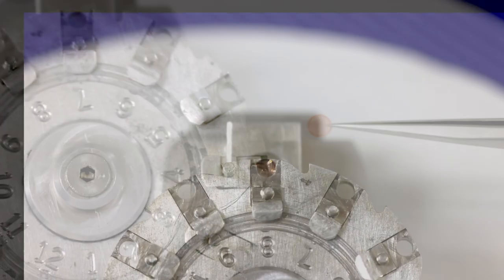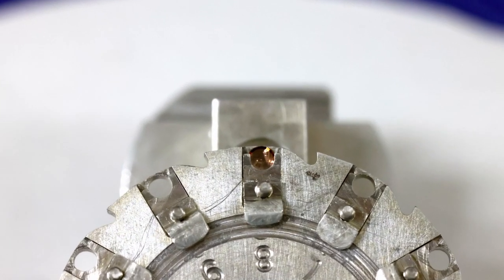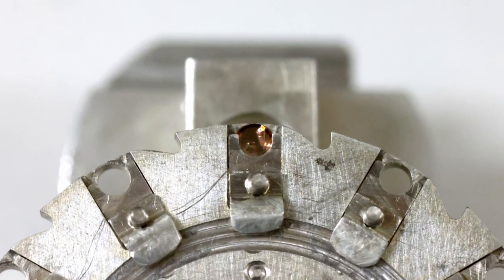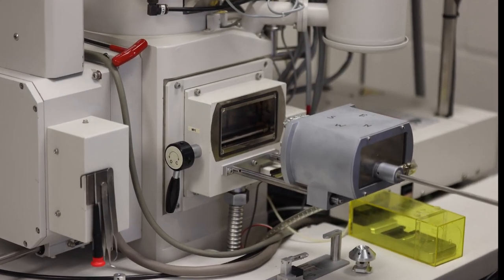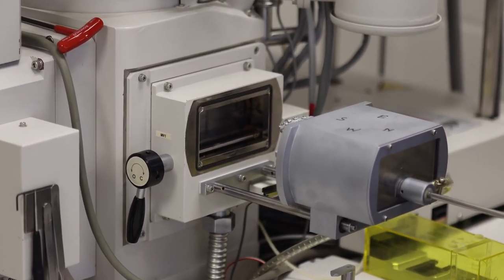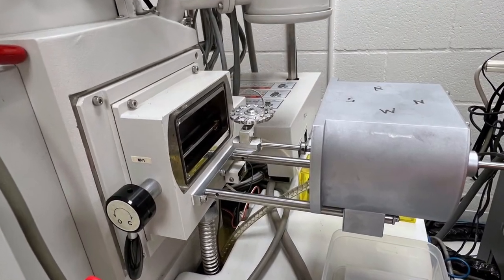Then we take these grids with the stained sections, place them in a fixture, and then we take that fixture and place it into the TEM.